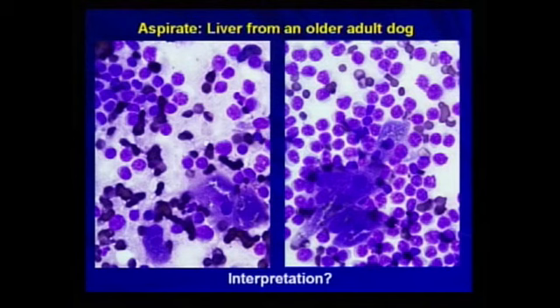But one thing I want you to look at is the predominant cell in here, with the exception of maybe this cell, which has a much larger nucleus and abundant foamy cytoplasm, which is a hepatocyte. Okay, here's one here. But the predominant cell is small, a little larger than an erythrocyte, with a small amount of cytoplasm, dark, clumped chromatin, and prominent nucleoli.